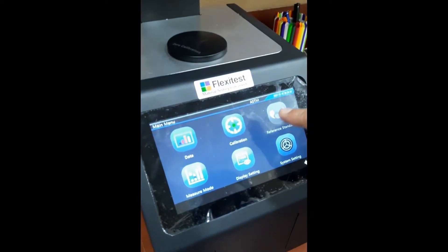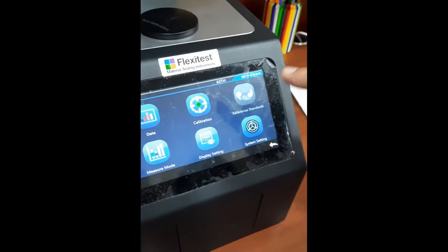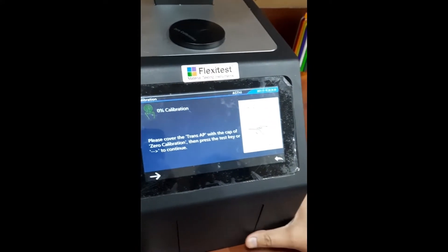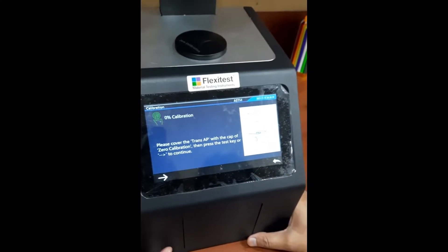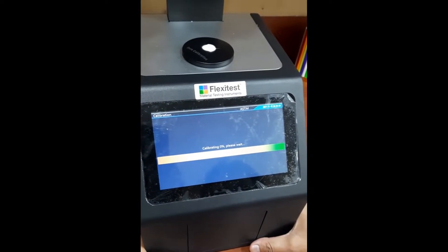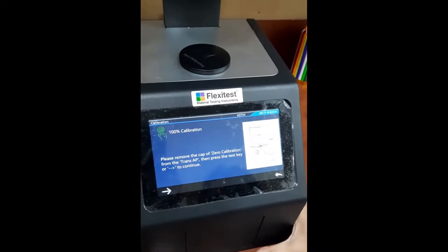I will start initially with calibration of the instrument. This is for 0% calibration. I will just press the button. So 0% is done.